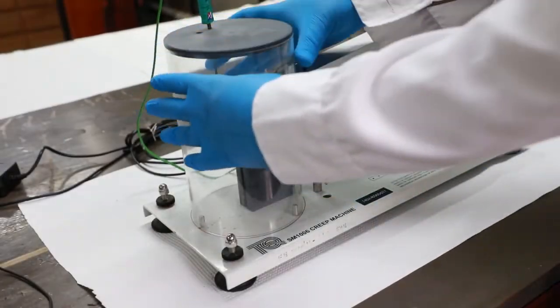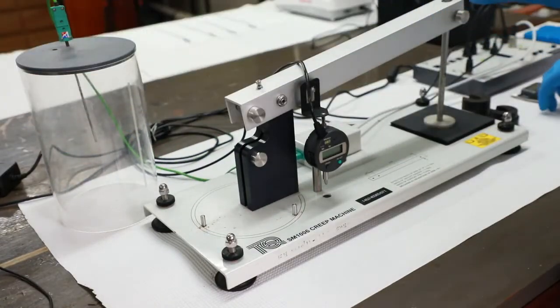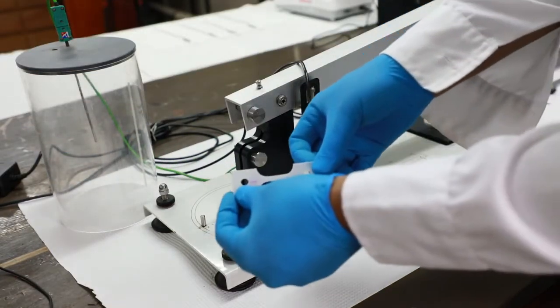Remove the cover and place sample number one vertically into the creep apparatus and secure with two pins while holding the lever arm.